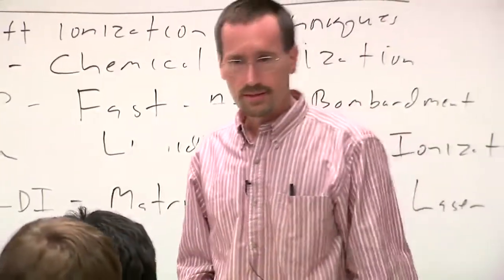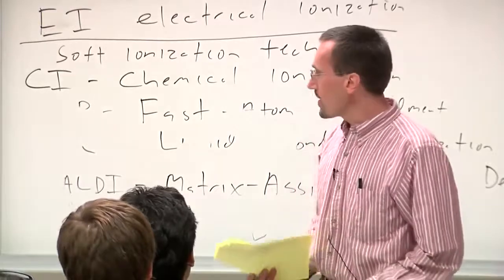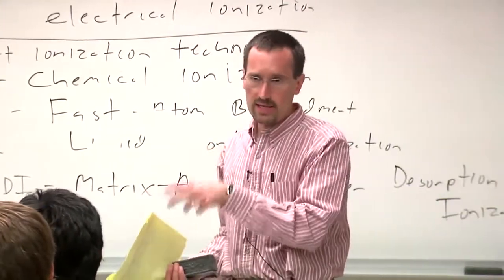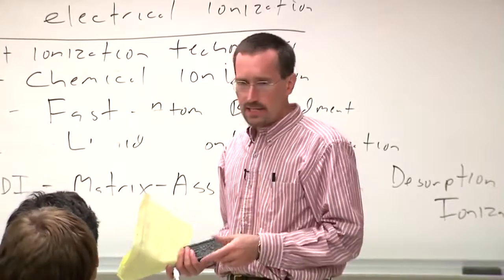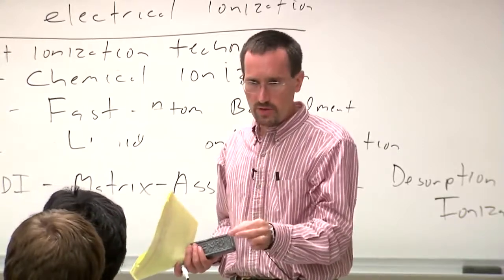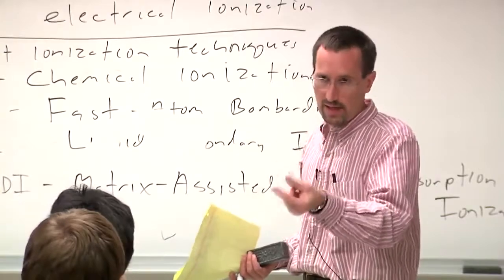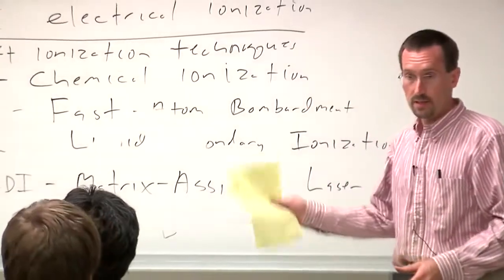This is kind of like a useless question, but do you get polymerization in a mass spec of radicals? Do you get polymerization of radicals in a mass spec? Because mass spectrometry is conducted under conditions where your molecules are not typically colliding, you will not see polymer. In ESI mass spec, which we'll talk about in a moment, because the molecules are actually starting in solution phase, you may ionize a pair of molecules that are already stuck together. So you may, for example, see a molecular ion that's derived from 2 molecules and, let's say, 3 charges. But yeah, you do not typically see polymerization.